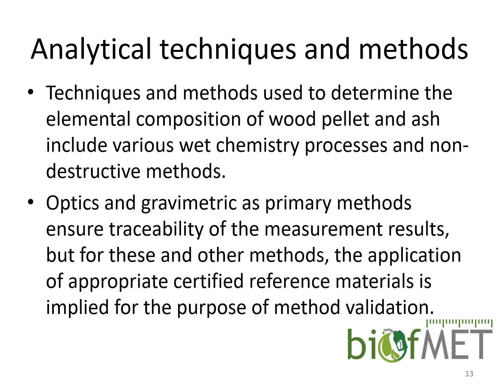But it is not always possible, and not only that, a lot of accredited laboratories, routine laboratories working in the field, are using so-called secondary methods, or methods also based on some kind of scientific principle, but with different paths of traceability. So usually, in order for those laboratories to validate their secondary methods, they need to establish traceability toward primary methods.